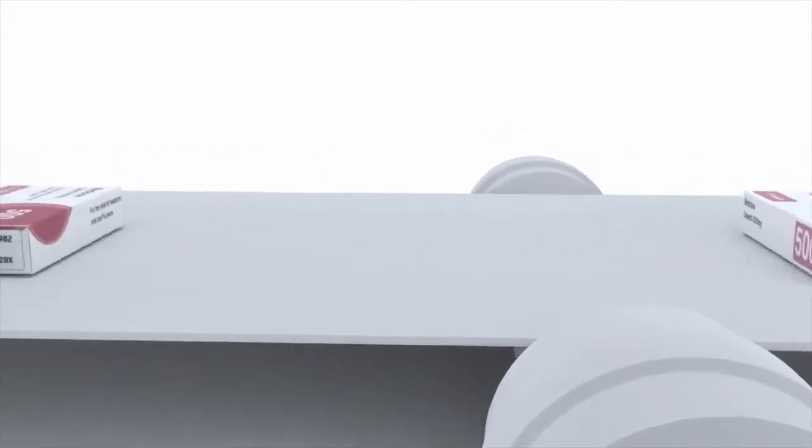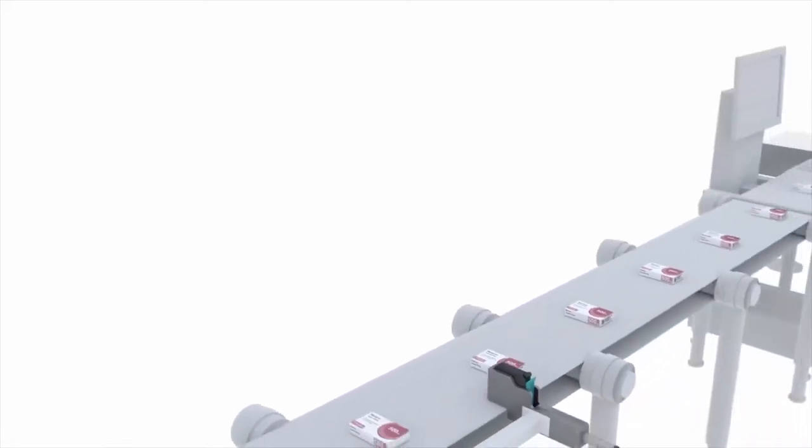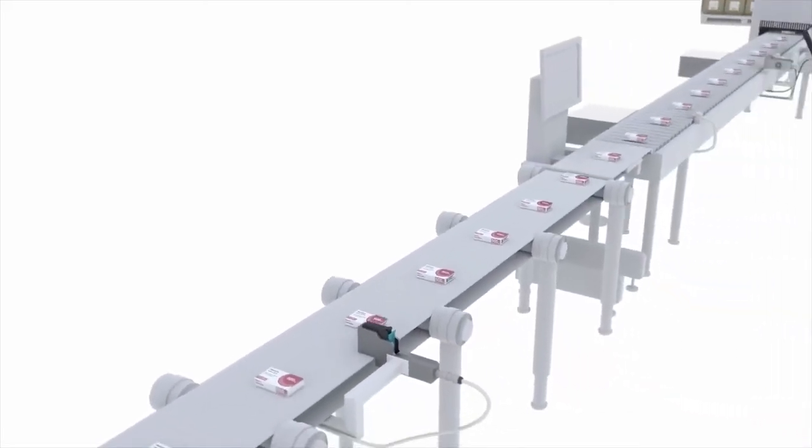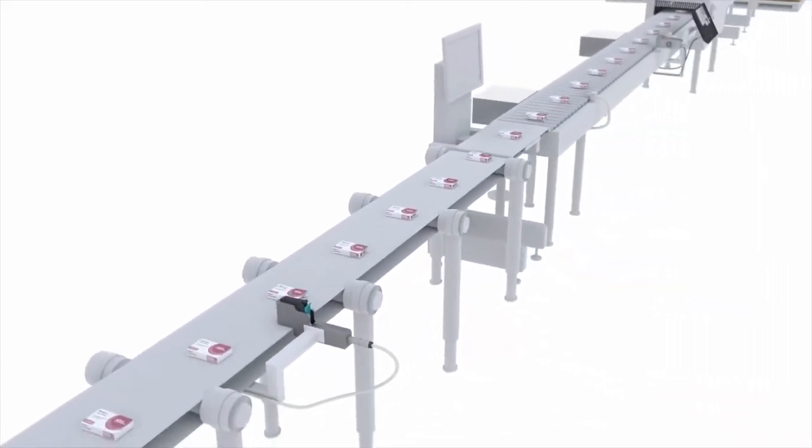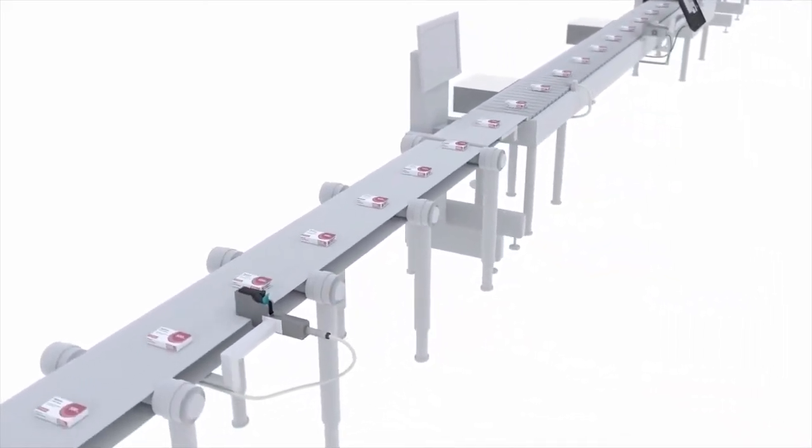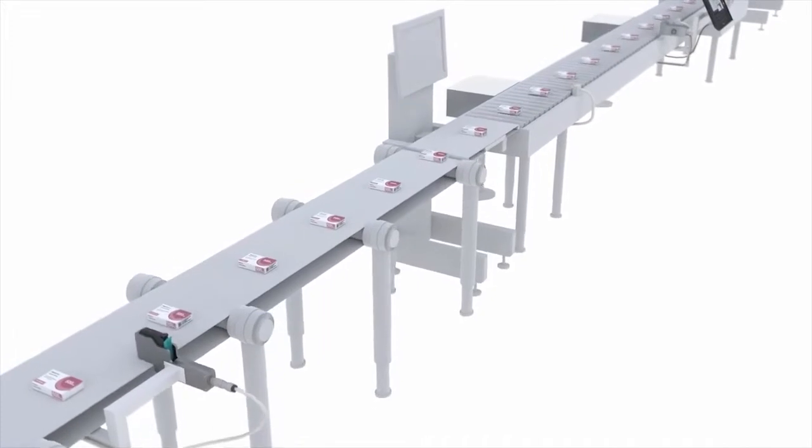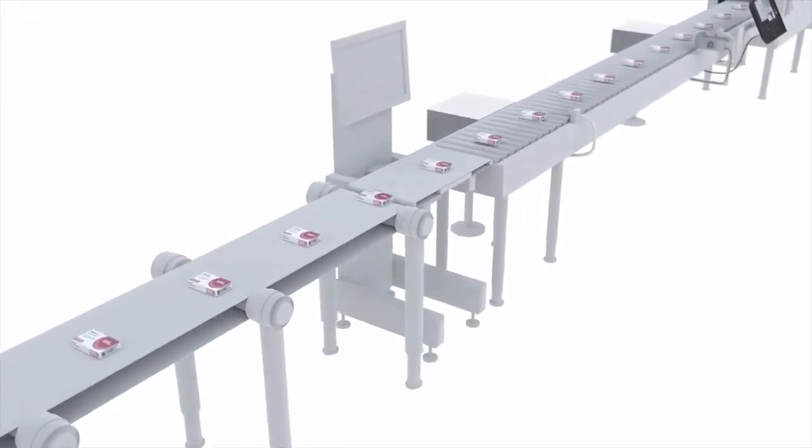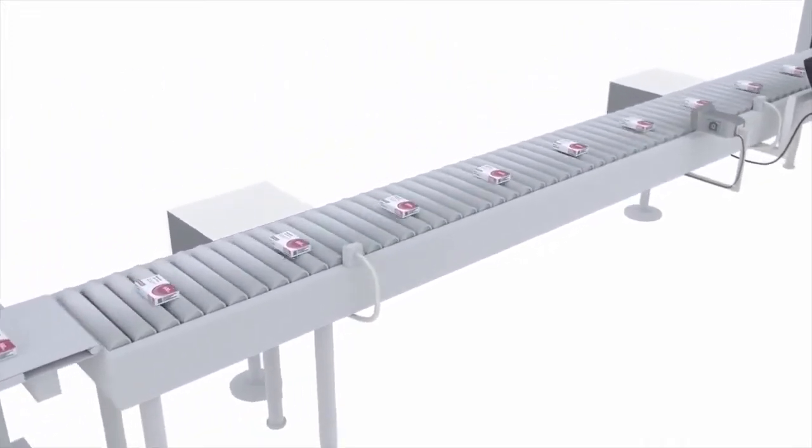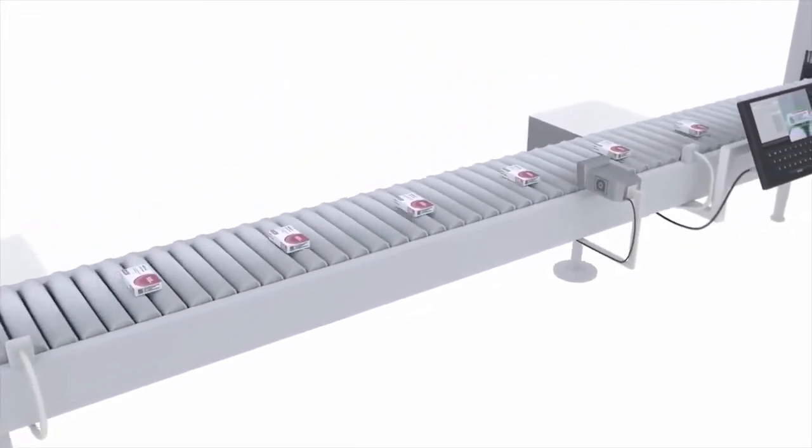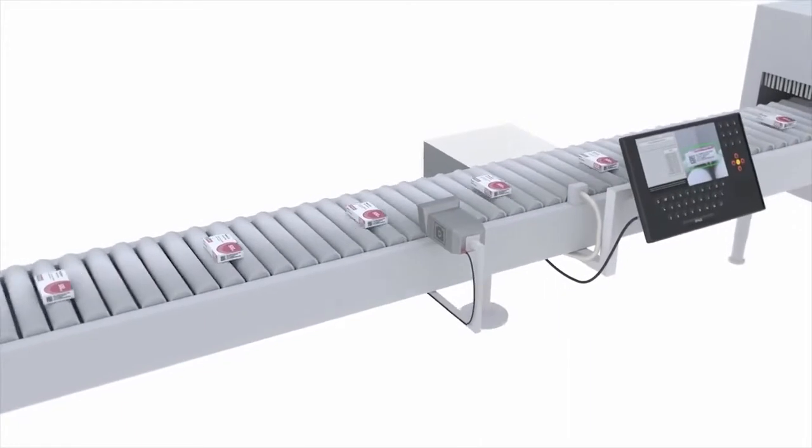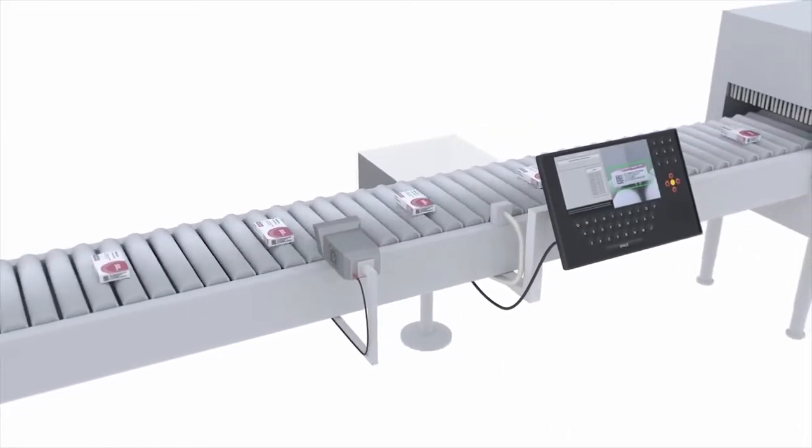SerialTrack has been designed to work alongside other components in the manufacturing landscape, such as MES and ERP systems. When production begins, all relevant data from the MES and ERP is collated and the manufacturing order can commence.